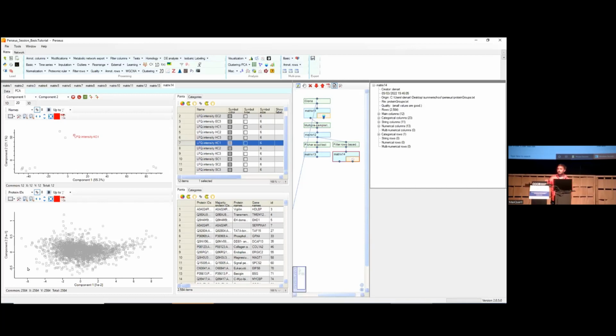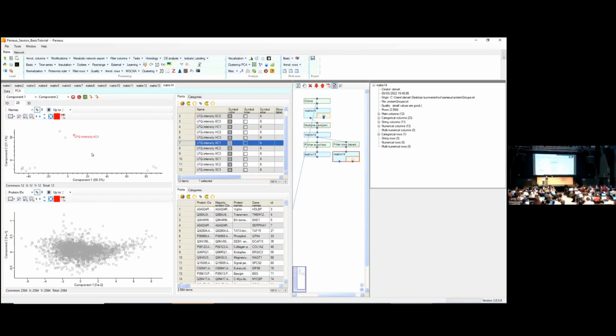Yeah, maybe last question and we move forward. Sorry, I lost you at some point. The upper plot, you expect it to have the least number of proteins, and this would mean that you don't have batch effect, right? Did I get it right? I didn't hear, can you explain again the upper plot? What you expect from it? Okay, yeah.